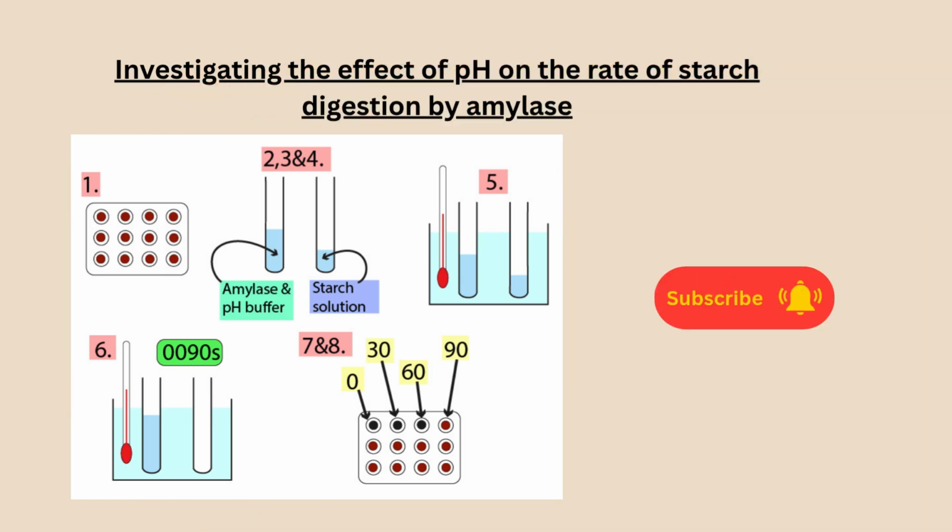Investigating the effect of pH on the rate of starch digestion by amylase, from scienceworksheets.co.uk.